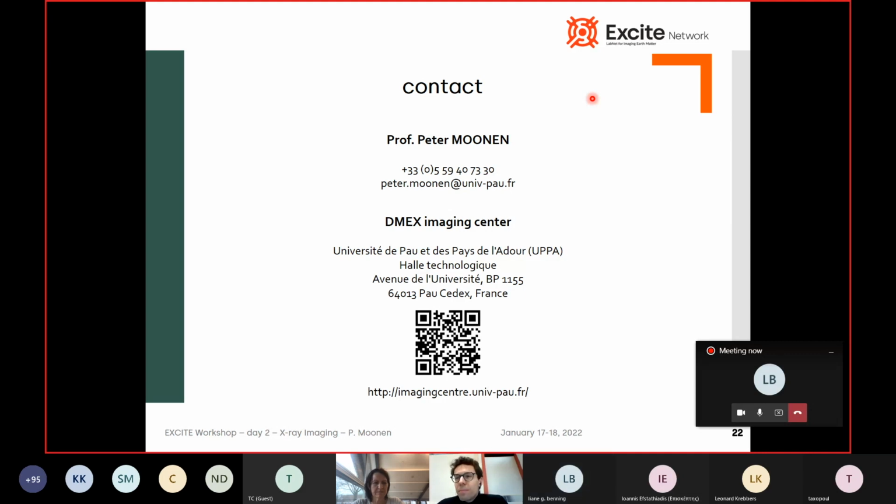There are two things. Obviously there is hydrogen, but there is also oxygen in water, in ice, and there is a density. As soon as you freeze things, the density still is on the order of, let's say, 1 gram per cubic centimeter, which is half of a rock.